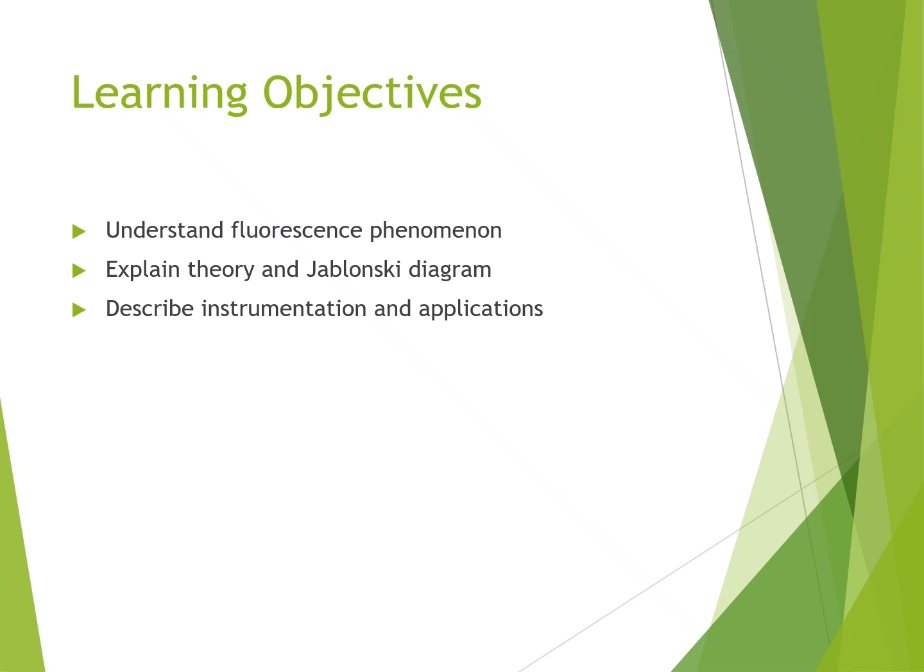Fluorescence is a very important technique as it is very useful in advanced applications. Fluorescence spectroscopy is used to identify molecules and in different analyses.